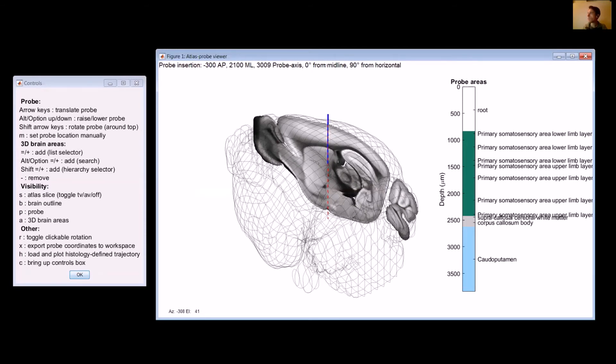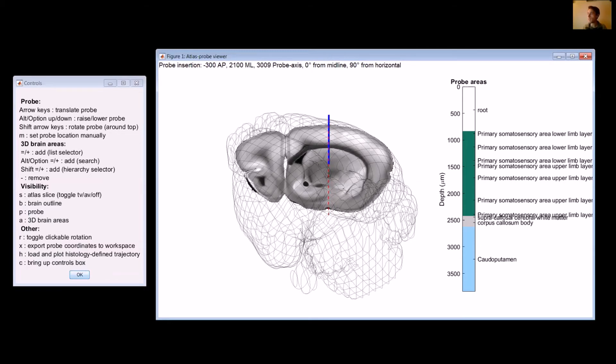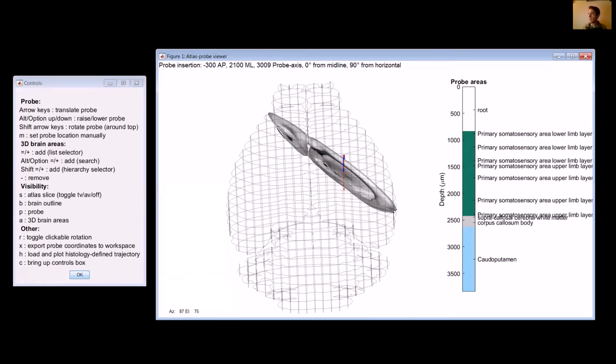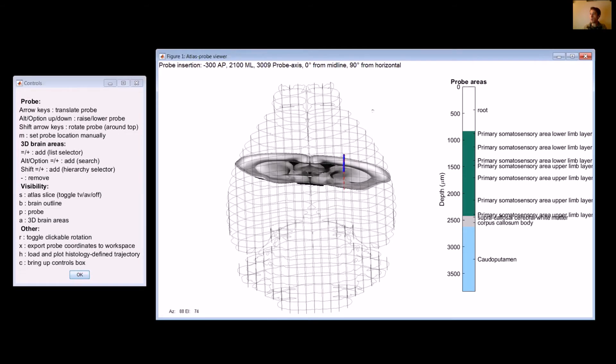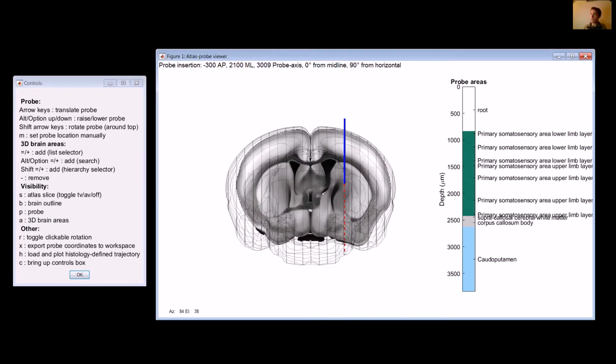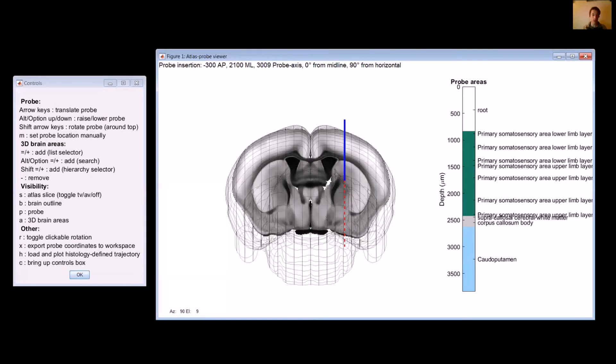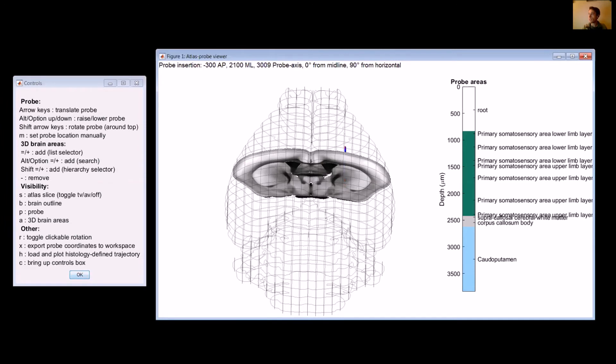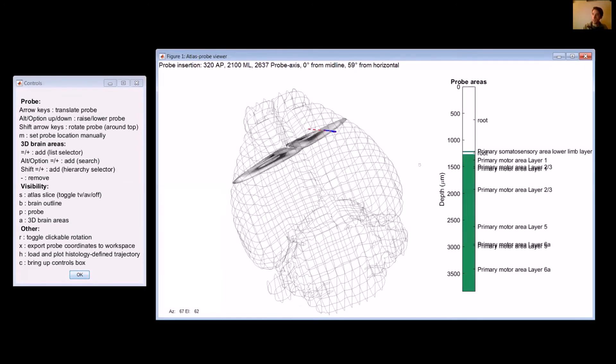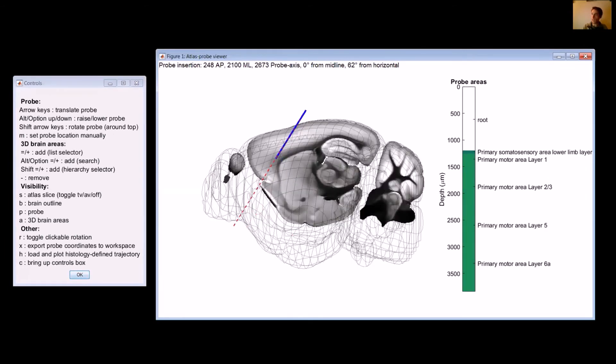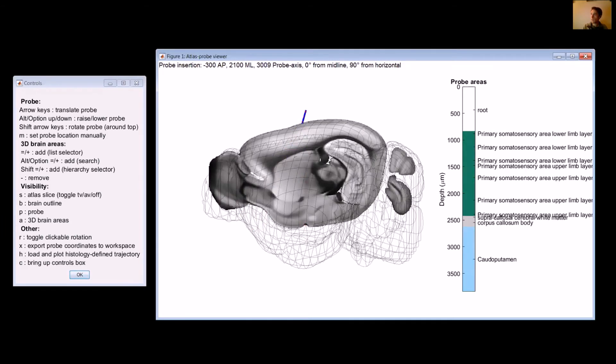You can also change the angles by holding down the shift key and pressing the arrow keys. In this case, there's two angles that you're going to set. The first is the probe axis. Oh, sorry. So the first is from the midline. So what I mean is if you draw an invisible line down the midline, then it's the angle relative to this. So zero is essentially pointing straight forward and minus 90 is pointing to the left and plus 90 is pointing to the right. This is essentially the angle you'd set your manipulator at. So like if your angle was coming straight from the back, this would be where your manipulator would be. Or if you were coming from the side, it would be like this. The other angle you'll set is how far down from the horizontal you are. So the horizontal would be here. At the moment, it's coming straight down. So it's 90 degrees from the horizontal. So this is just the axis that you'd set your rotation of your manipulator.